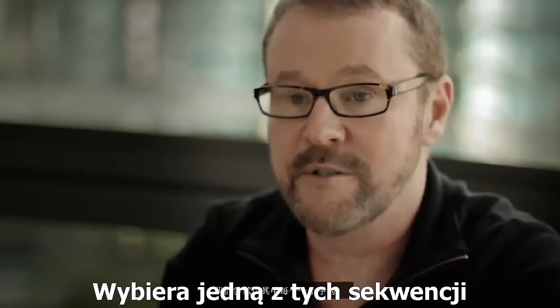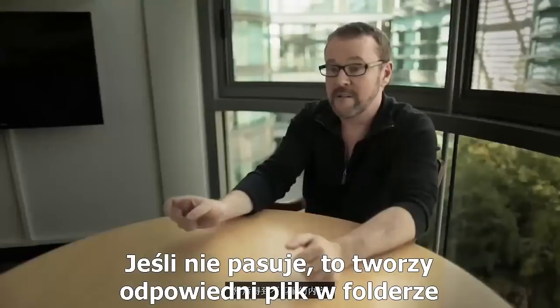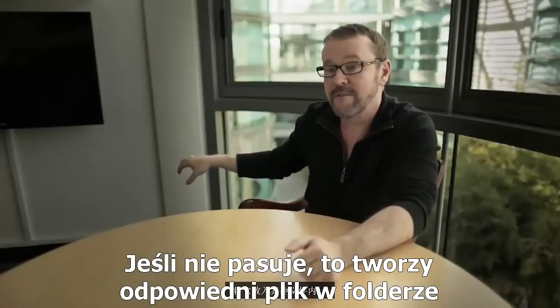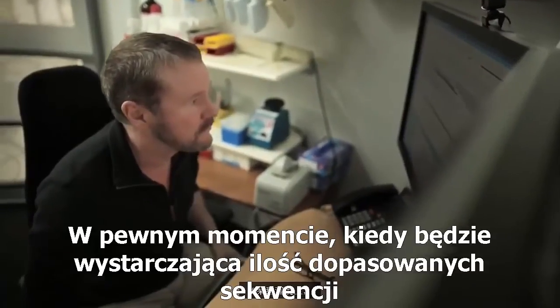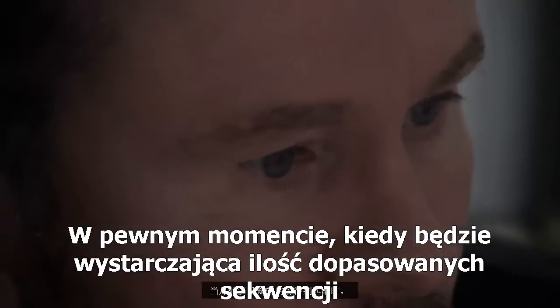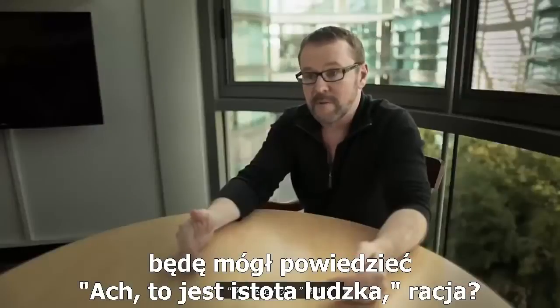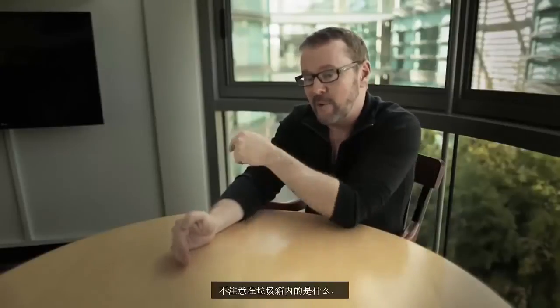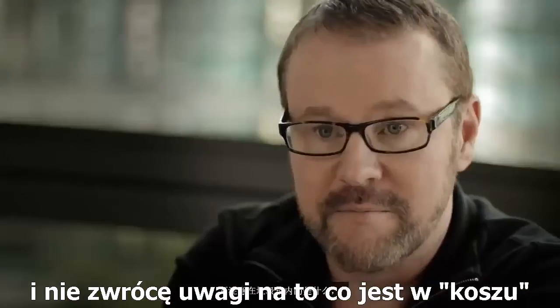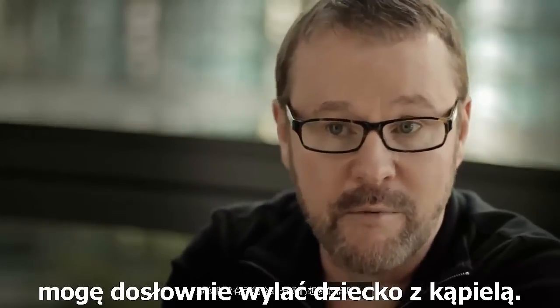It takes every one of the little sequences and tries to match it against the known, and anything that doesn't match it puts in a little side file and says this is unknown. At a certain point, when enough knowns are matched, I can feel comfortable saying, this is human, right? But if I don't pay attention to what's in the garbage can, what the computer program is throwing away, I could literally be throwing the baby out with the bathwater.